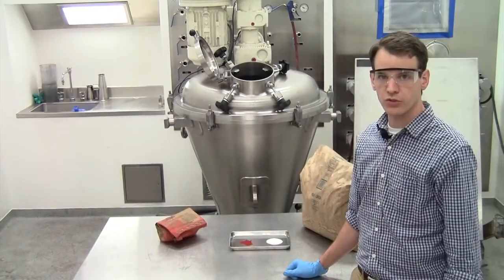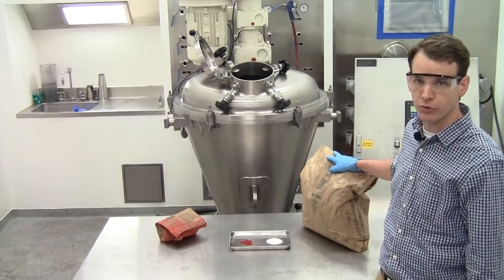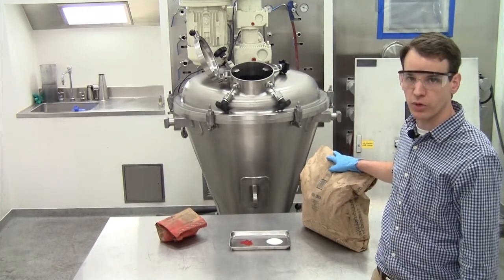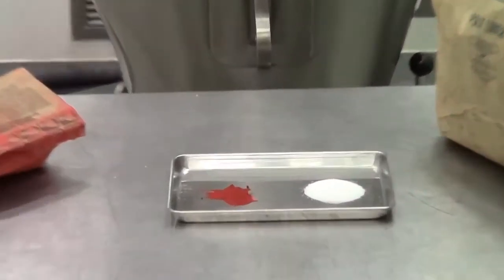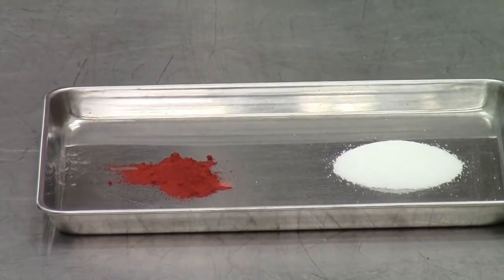For today's demonstration we'll be blending extra fine granular sugar with an average particle size of about 400 microns with iron oxide pigment that has a particle size of less than 20 microns. We'll be mixing 99.2 percent sugar with 0.8 percent iron oxide pigment.